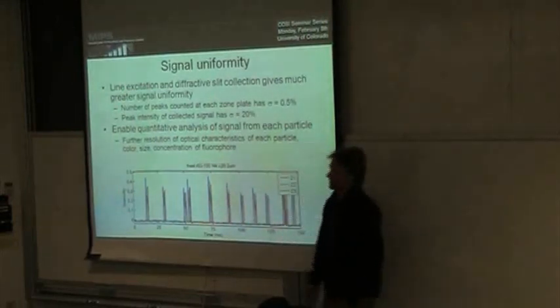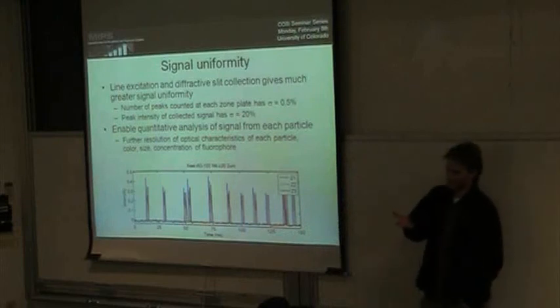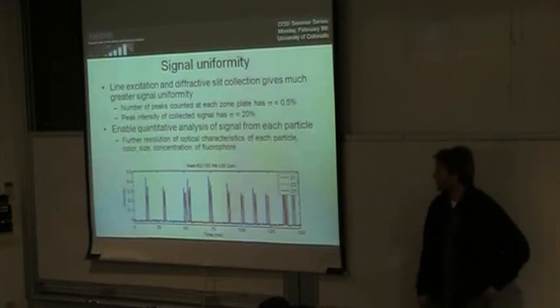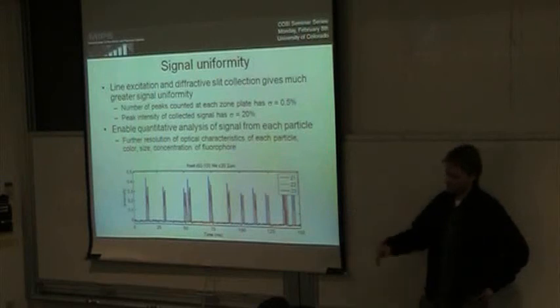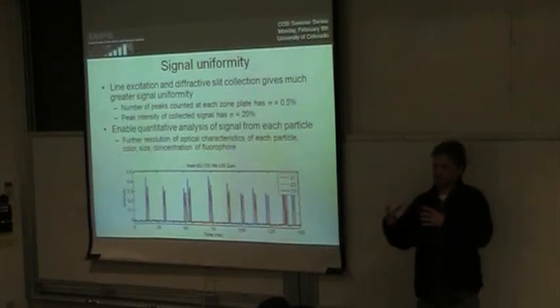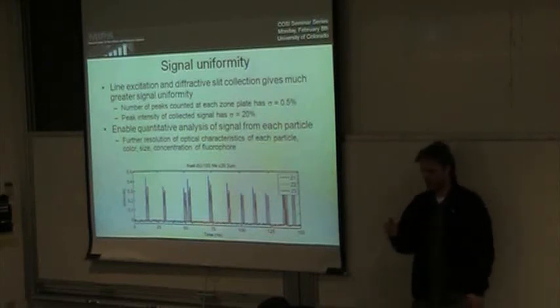The depth was hard. I was sitting there measuring thicknesses of cover slips, and I'm not even sure that they were that flat. There might have been some wedge angle. In the case with the circular spot, I just defocused the light a little bit, and that was fine. But with the cylindrical spot, I really wanted that front focal plane to be exactly at the right depth, so I was sensitive to depth. So that alignment was actually hard.